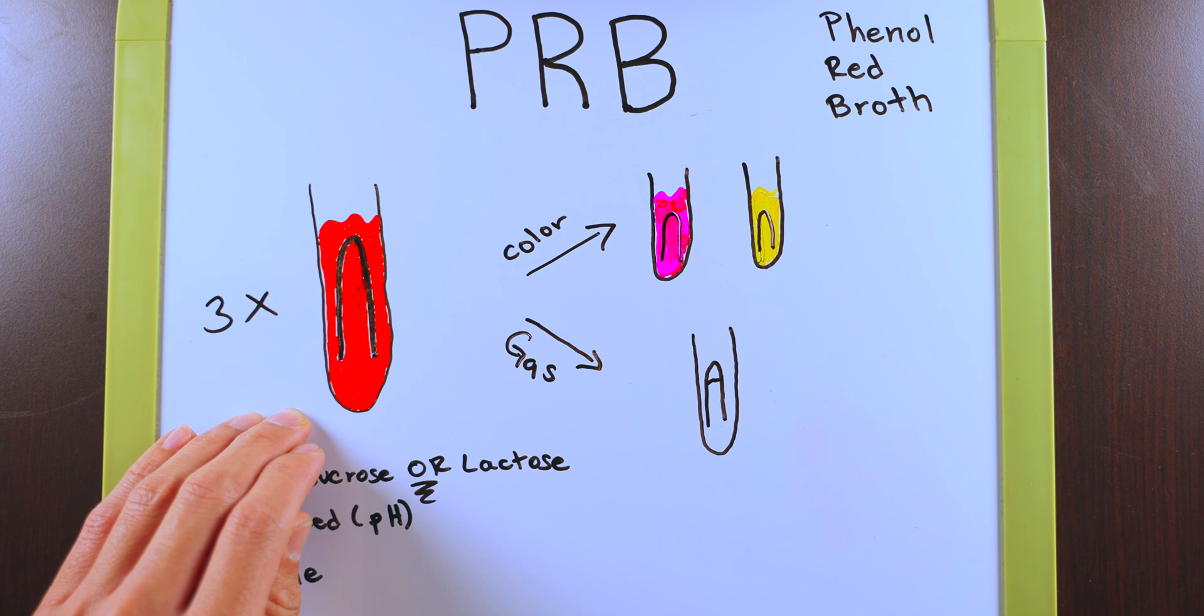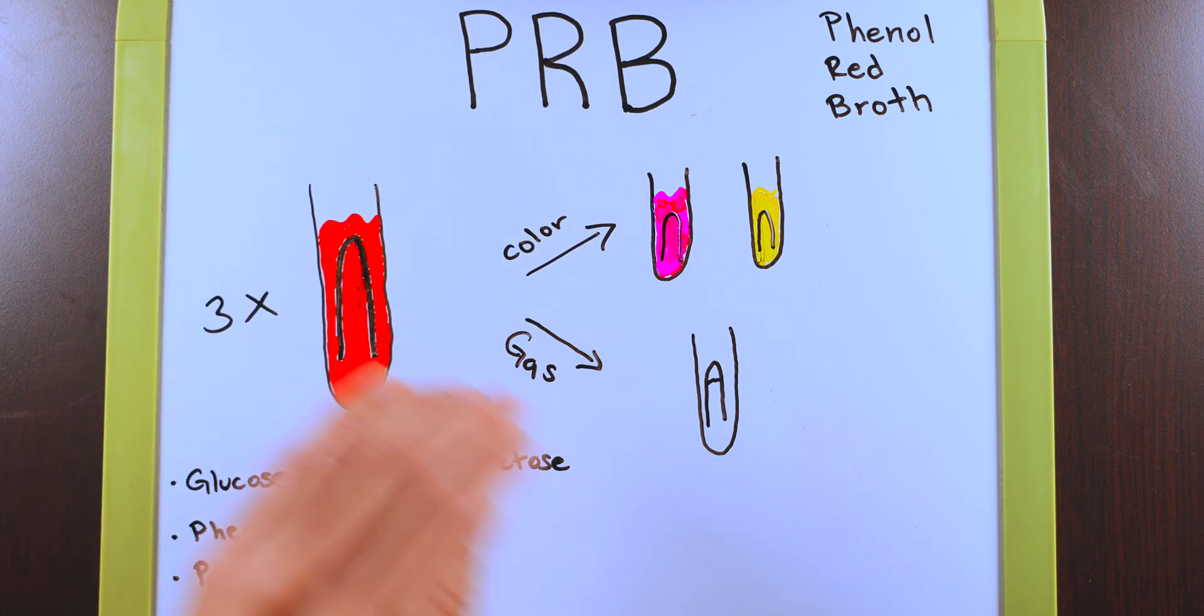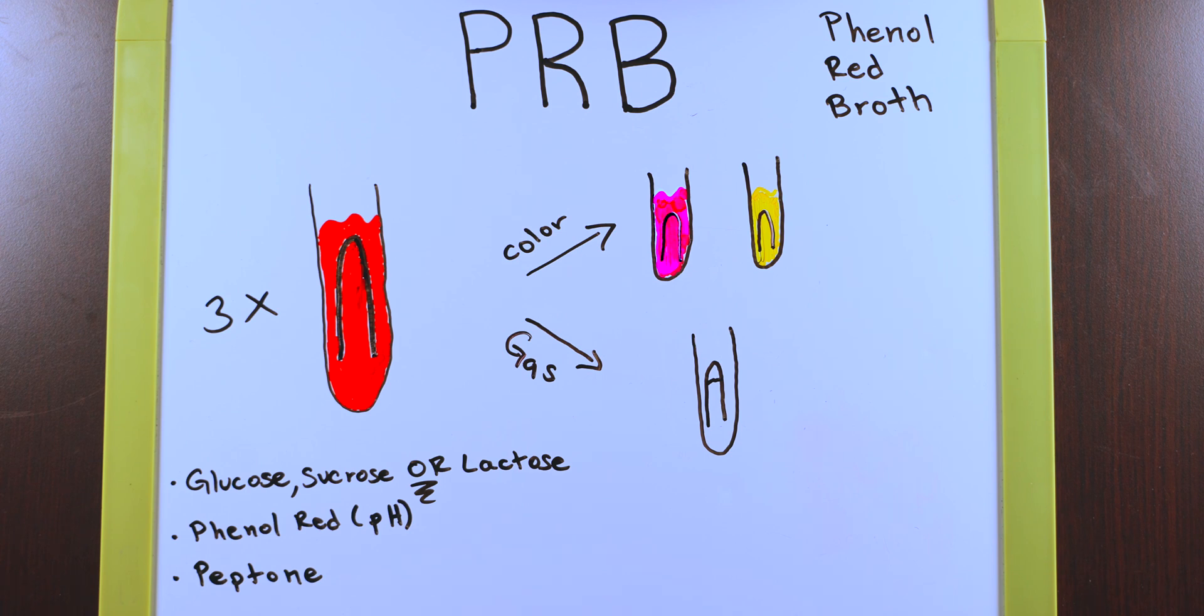You should be able to see a visual change from this Durham tube to this one to indicate to us that we have a positive gas production test here, meaning that the bacteria produce gas in its metabolic processes.